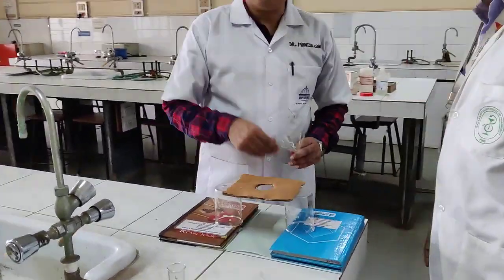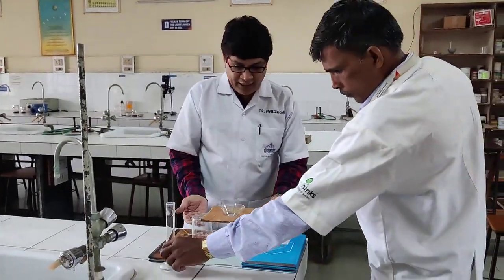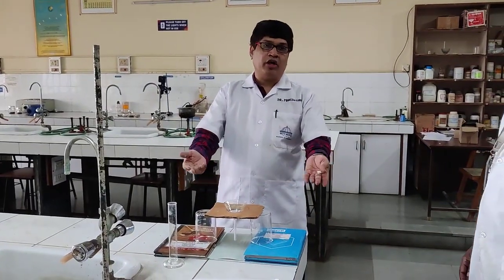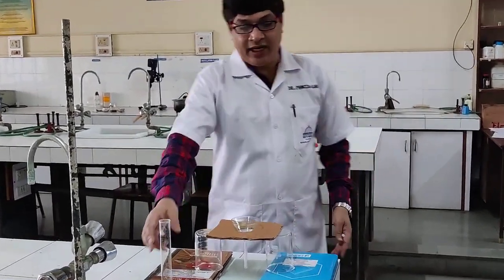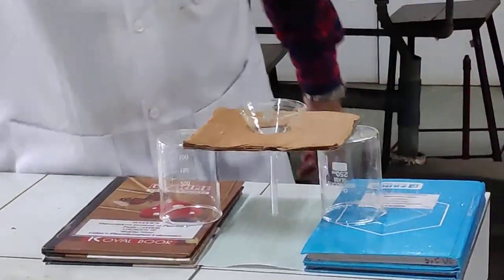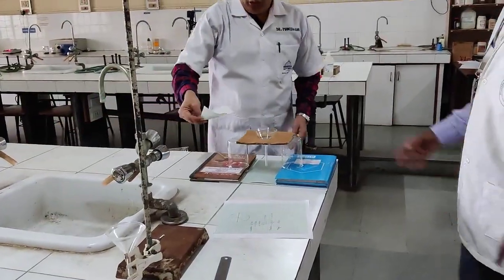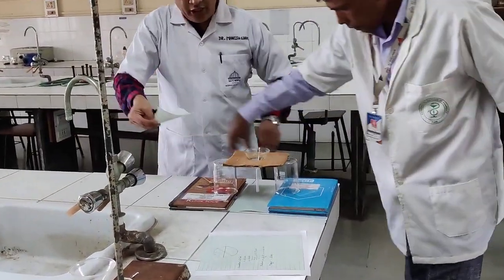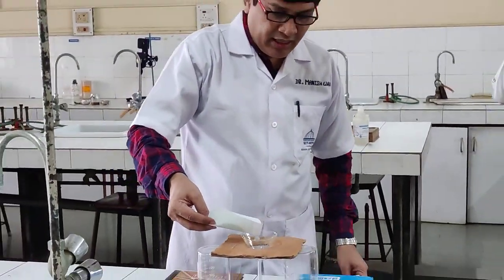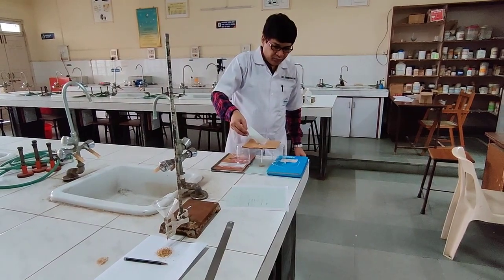You can keep the graph paper or you can keep the normal paper over there. You can put the funnel inside it. You can adjust the height with the help of books or anything that is available at home. Then you can take the granules, and these granules you can use for finding out the angle of repose. The same thing you are going to do.